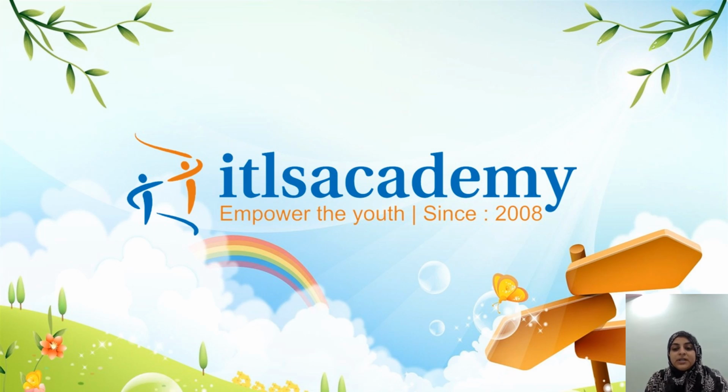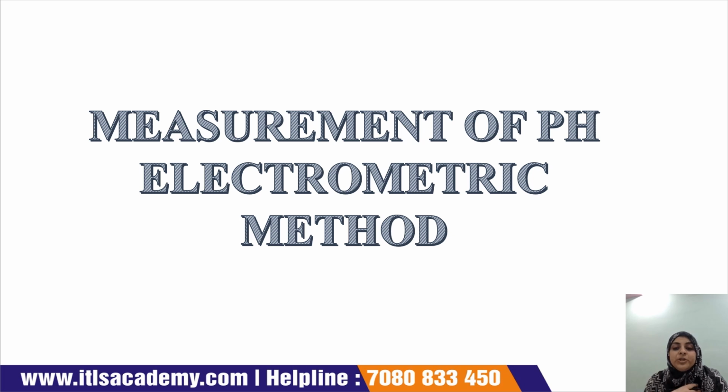Today we are going to discuss the topic of measurement of pH by the electrometric method. First of all, we are going to discuss the introduction of pH. Then after that we are going to discuss the electrometric method.